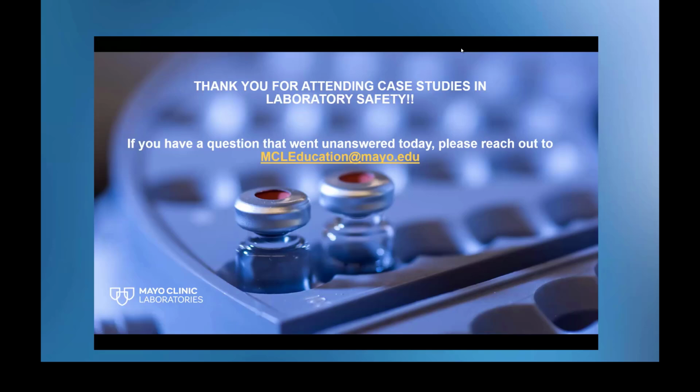There's a question, is your safety training online or in person? Primarily online for new employees. All of those modules capture electronically that the course has been completed. I really rely on the frontline staff to do more real life safety training for our new staff. So for example, if you're new to the building and new to a lab, someone from the laboratory is going to walk you around and point out the fire exits, where you muster for severe weather, and that type of thing at the lab level.